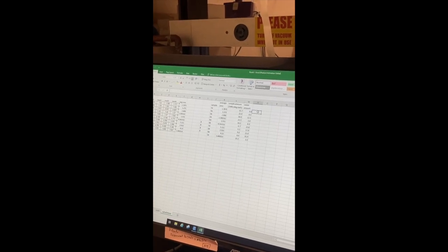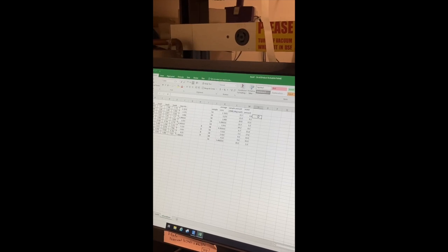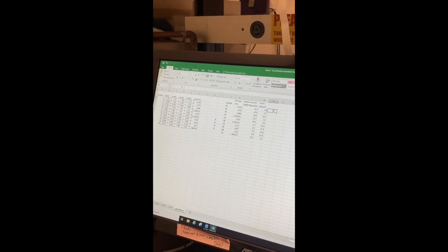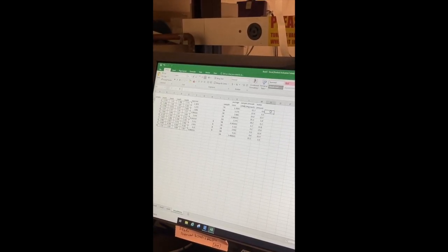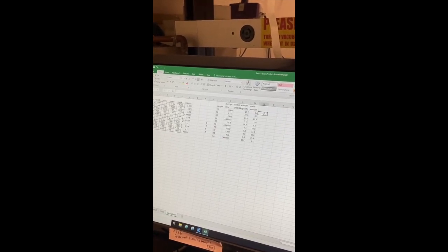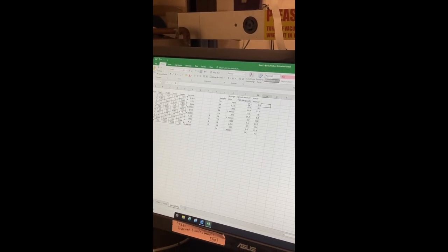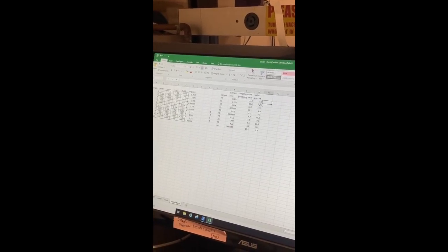So that will be 7.5 microliters of sample buffer for a total solution of 2 Western Blot prepared samples. And so that leaves us with a final volume of 22.5 microliters that needs to be made up for by our protein sample amount and our water amount.